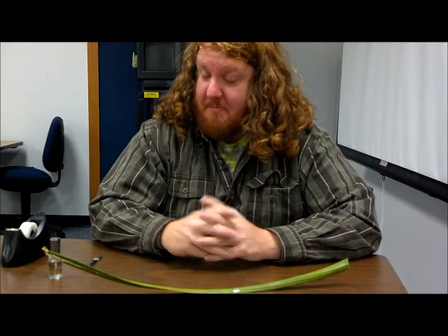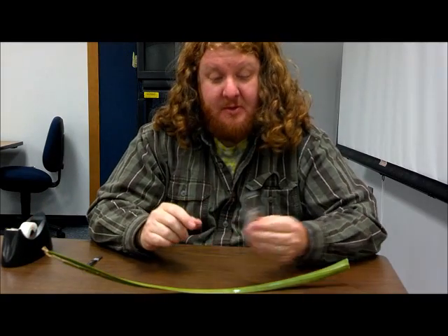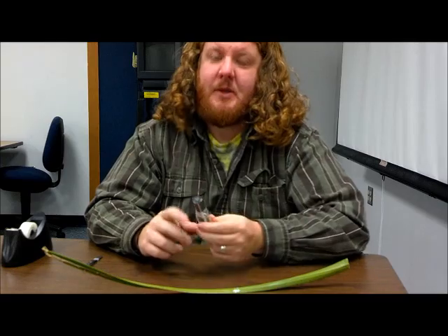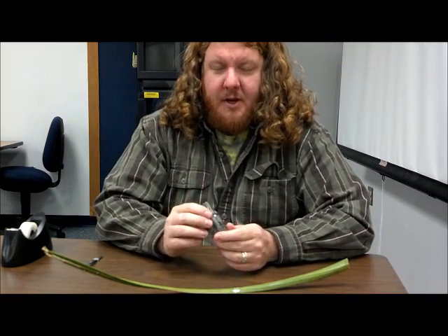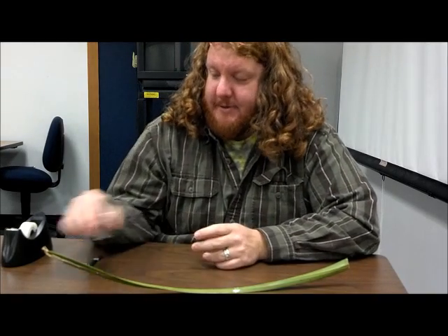Hello, and welcome to Mr. Scott's Everyday Science. Today's episode is going to focus on a simple experiment using only nail polish and a microscope too. What we're going to be doing today is using this everyday item to do real science.